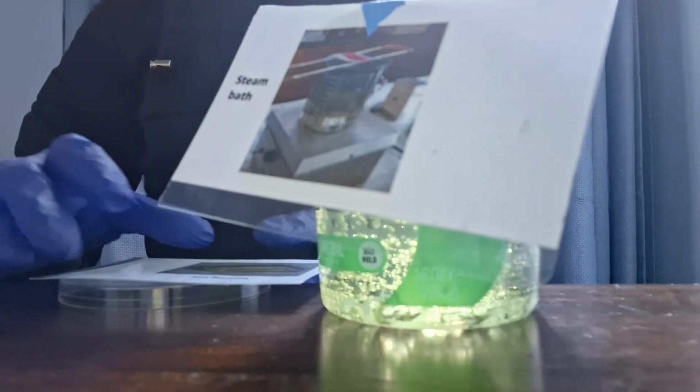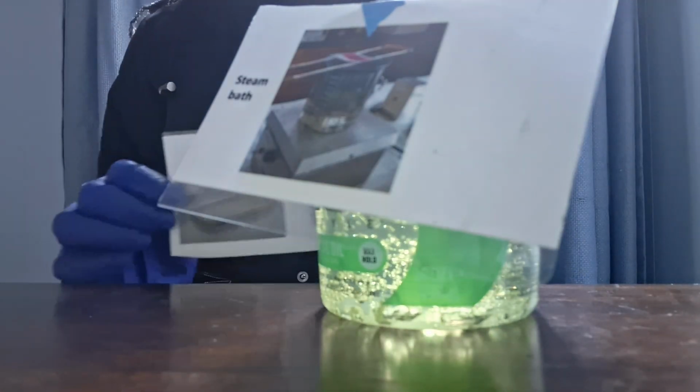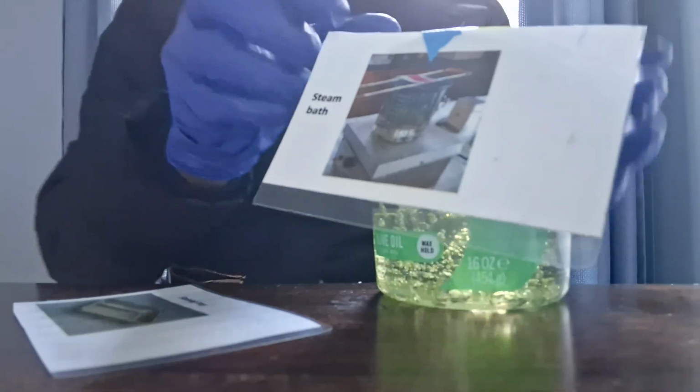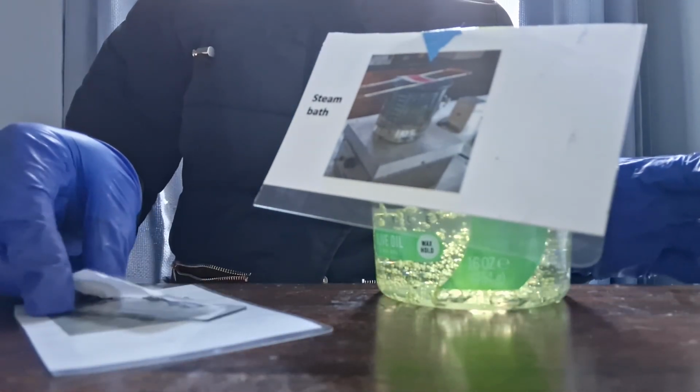I tried to put this on a staining tray, but we're going to remove it because it's not seen well. So we put the staining tray down here, take it off gently, and put it down here.